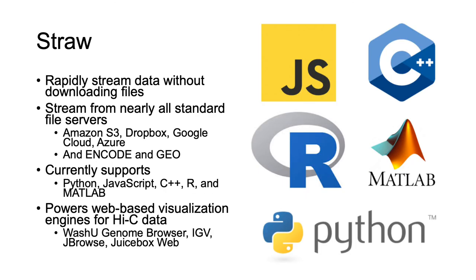Finally, you can easily access data stored in Hi-C files via Straw. This includes files hosted on ENCODE or on Geo. Straw is used as a back-end for multiple different Hi-C visualization tools, and we are also using it for rapid iteration on machine learning algorithms.